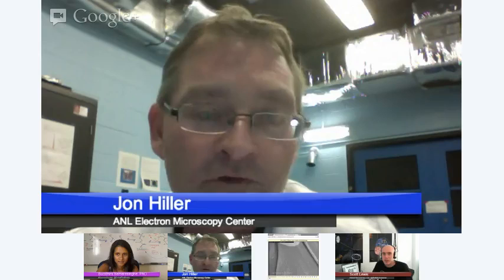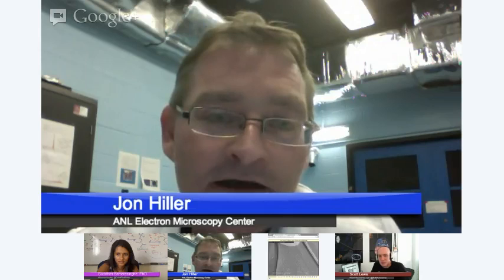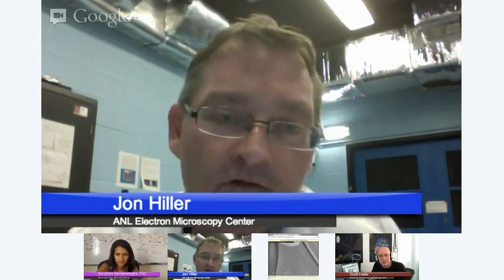You know, very carefully. Can do it electrochemically if you have something that can electrochemically etch. But if you have something that's like diamond, that is resistant to everything, you have to use these focused ion beams to carve out and make a very, very sharp tip to analyze it further. And taking it even one step further, now let's go ahead and put a gas injection system into the same microscope and open up the gas valve and allow a precursor of gas to flow into the microscope.